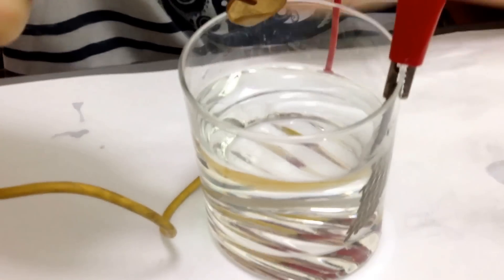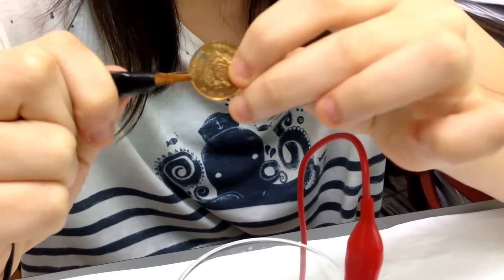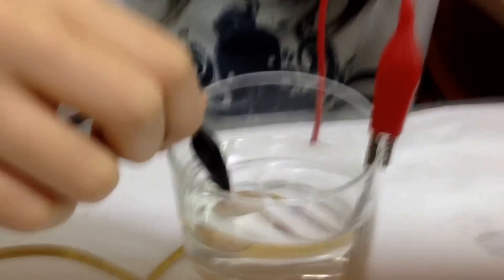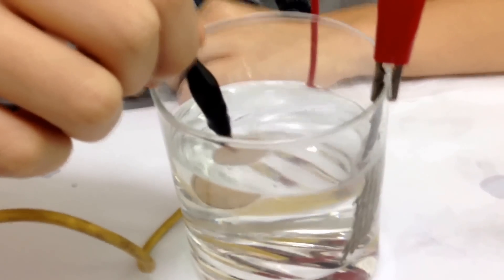Take it out and rotate. Relax, relax — how much relax. Don't worry, the gold will not run away. Relax, okay.